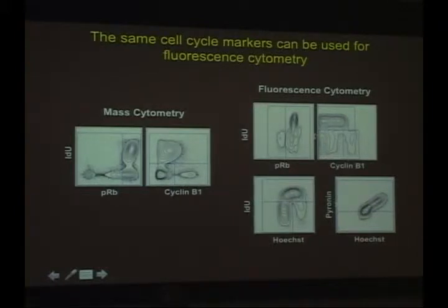If you, of course, have to use an antibody to detect the IDU incorporation, but analyzing these same cells by fluorescence, you can define these same populations. And this may, in some cases, be a good fluorescent approach, depending on what channels your antibodies might be on.